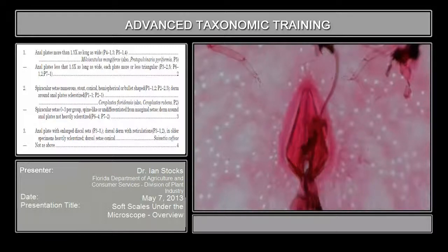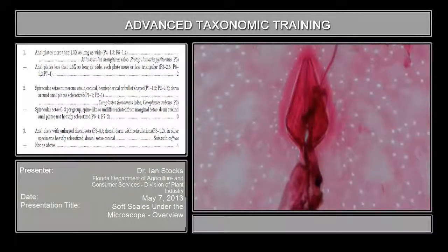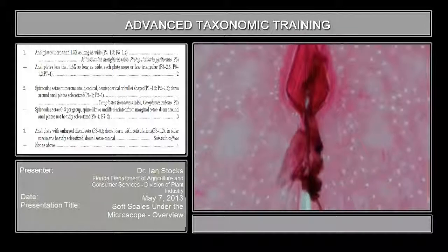They're by and large roughly some version of a triangle in outline. And this is a fairly extreme version of how distorted that triangle can be. The exact proportions of the size of this triangle in this case are characteristic of this genus. Now, associated with this anal plate is the structure here, which is the anal tube. And that's the structure that ejects the honeydew droplet.